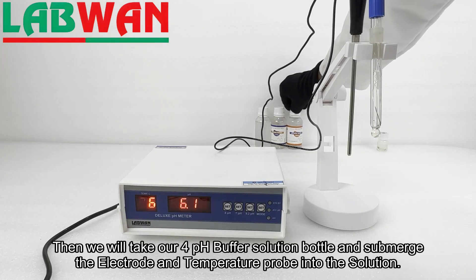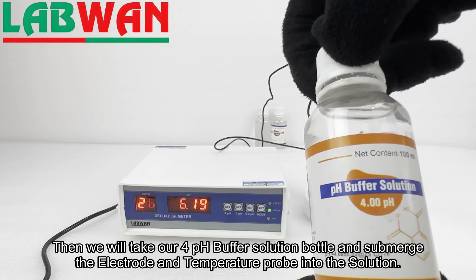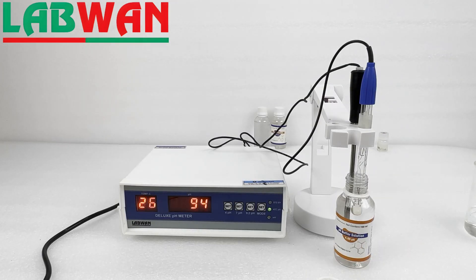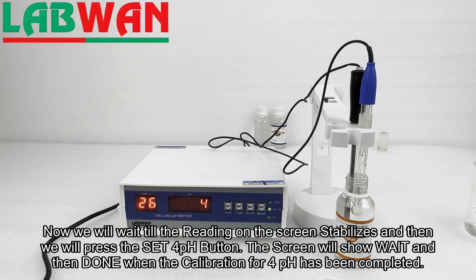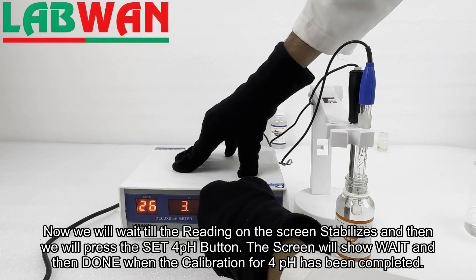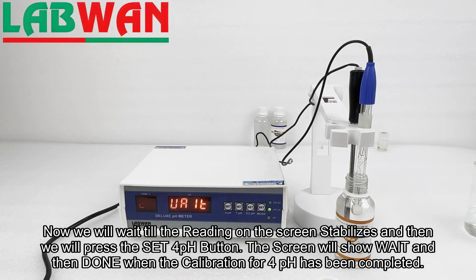Then we will take our pH 4 buffer solution bottle and submerge the electrode and temperature probe into the solution. We will wait until the reading on the screen stabilizes and then press the Set 4 pH button. The screen will show 'wait' and then 'done' when the calibration for pH 4 has been completed.